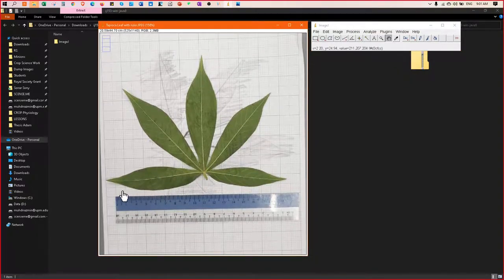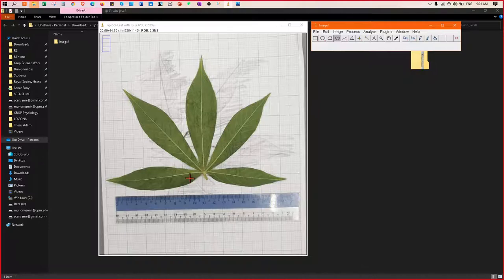So the way that I want you to use now is you can measure this using the freehand selection. Basically you are tracing this area of the leaf using the freehand selection, and then you click the measurements. I know it's not easy to use the mouse, but you can work leaflet by leaflet. Once you are done with one leaflet, then you press M and then you can continue with the other leaflet. I'm just going to use my pen. You can enlarge the image if you need to do so. Oh, it's not that great. This requires a lot of patience.